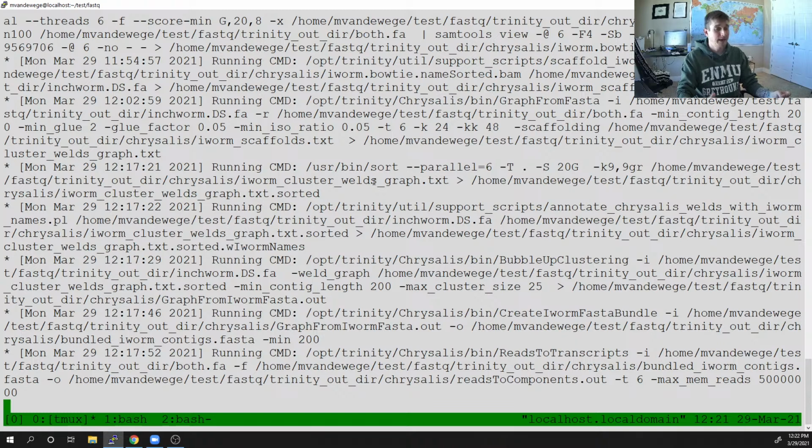which is looking at how many reads and how many transcripts are present, and identifying the open reading frames and annotating, right? Even when all is said and done, all we're going to see is the transcripts. We're going to see 5' and 3' UTRs and start to stop codons, but we'll have no idea what that gene is. So the next step is Trinity assembling, finding the open reading frames, and then annotating those open reading frames to a specific gene.